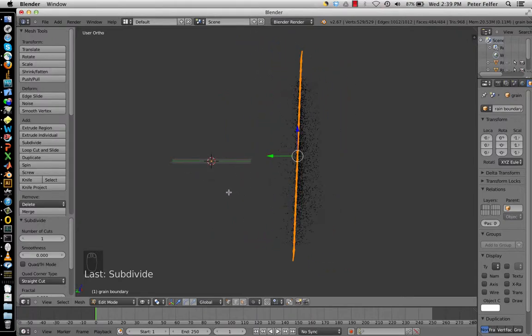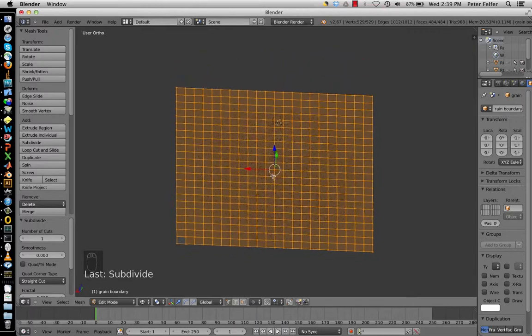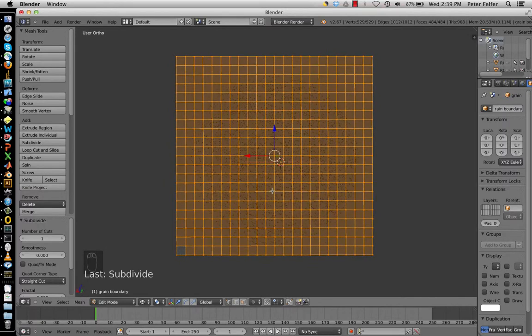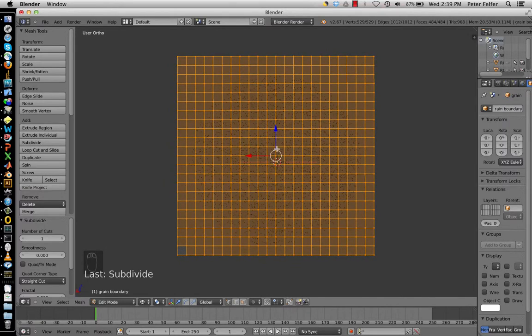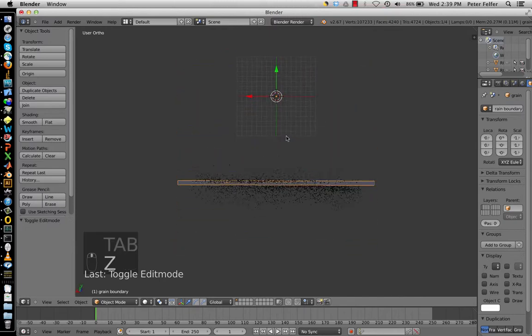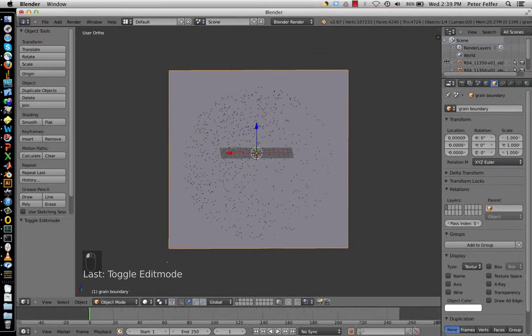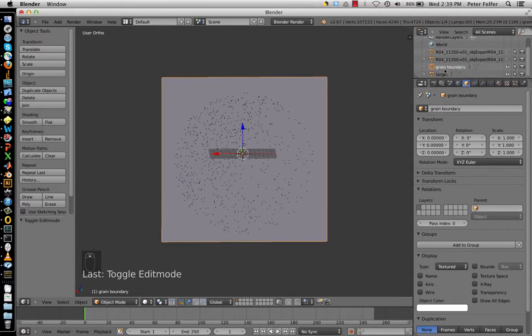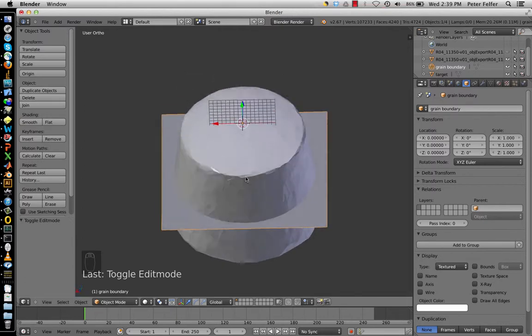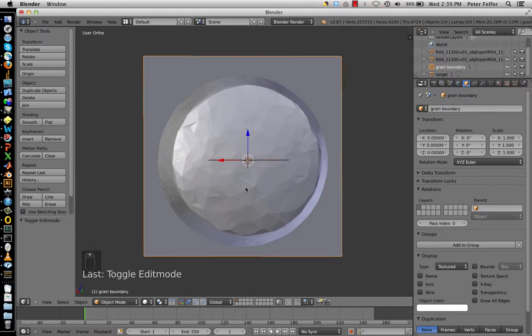It does have an influence if you want to do things like interfacial excess mapping, but for that purpose there will be a more in-depth tutorial, of course. But for now we'll leave it at that, and deselect all of the atoms, and this is our object. So you can see now our plane is approximating the grain boundary, and this is the point now where the hull comes in again. So you can see now that some of the grain boundary approximation extends beyond the hull of our data set, so we need to remove that bit.